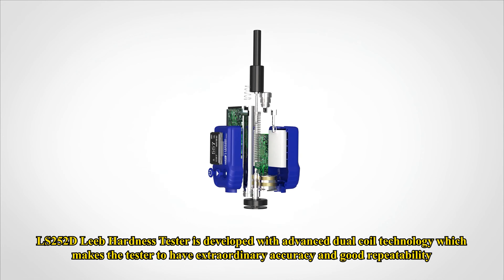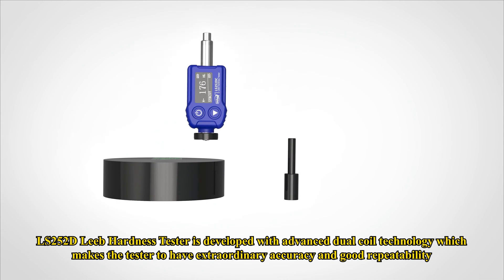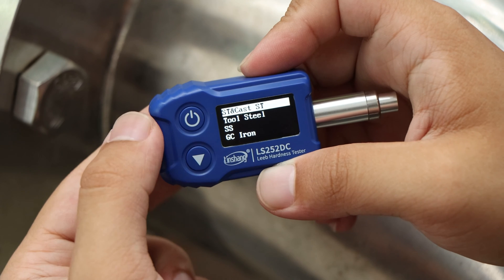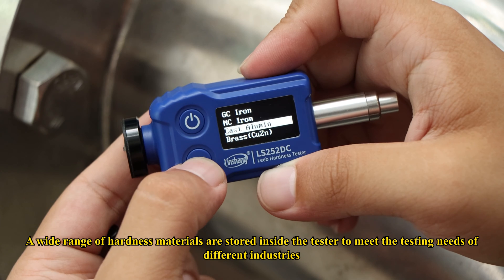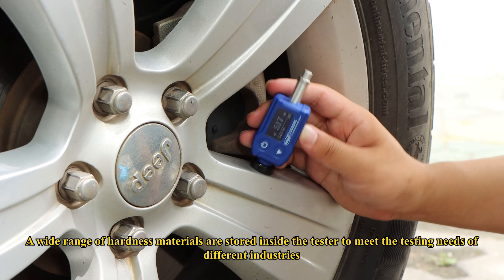LS252DC Leeb hardness tester is developed with advanced dual-coil technology, which makes the tester have extraordinary accuracy and good repeatability. A wide range of hardness materials are stored inside the tester to meet the testing needs of different industries.